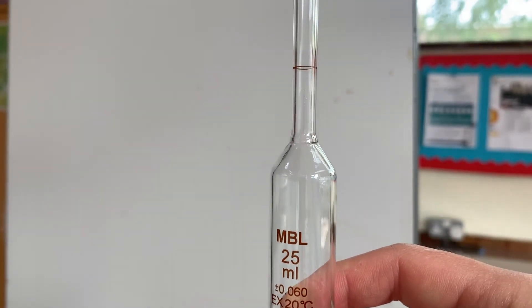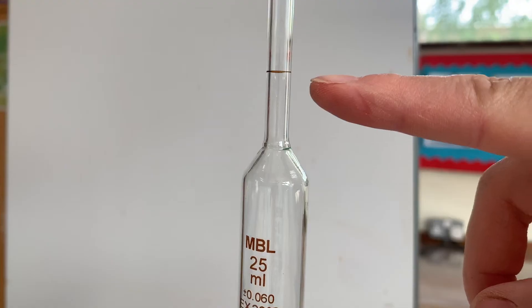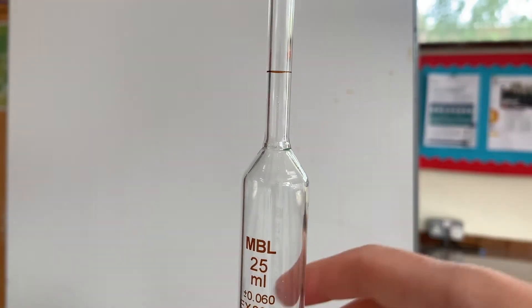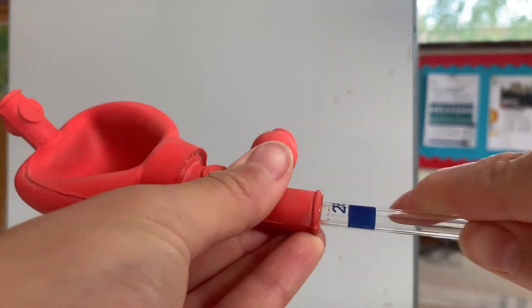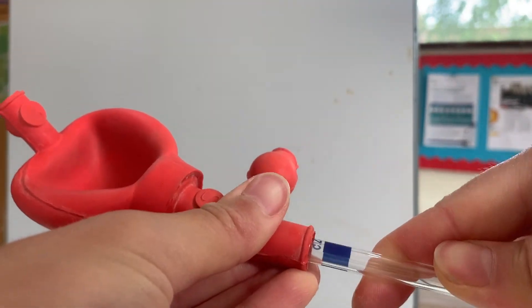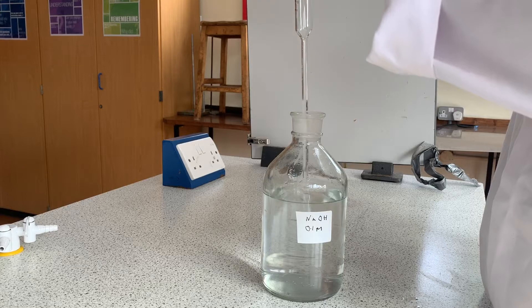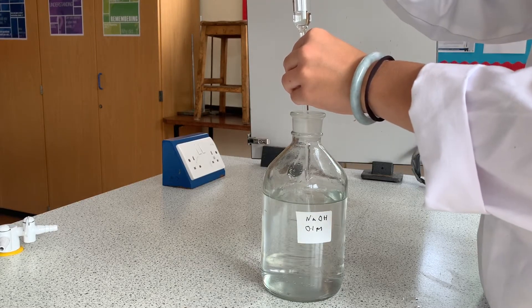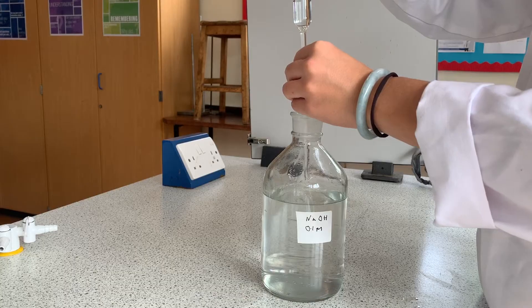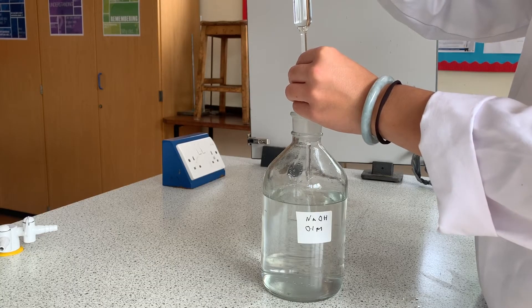You should fill the liquid up to the line on the pipette using a pipette filler. This should be placed on very carefully to avoid accidents with the fragile glass. Here I am filling the pipette with 0.1 molar sodium hydroxide solution.